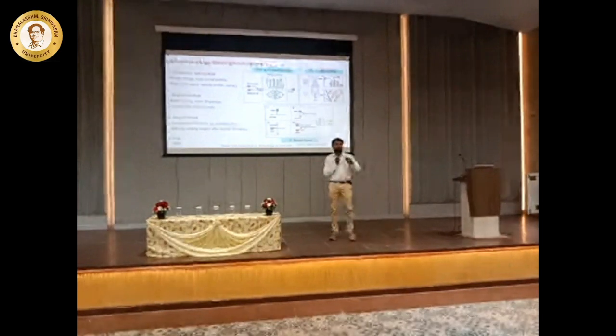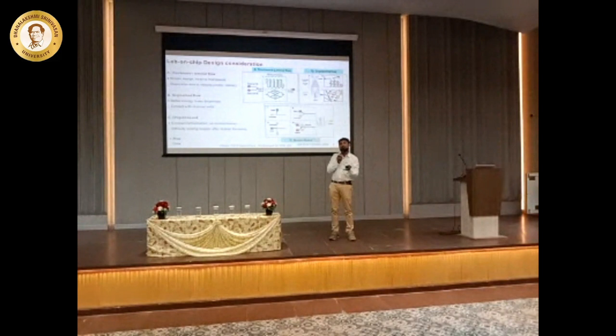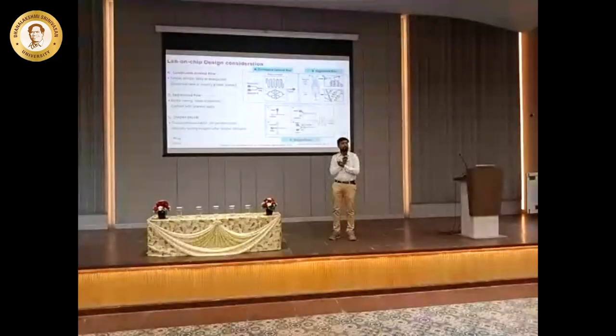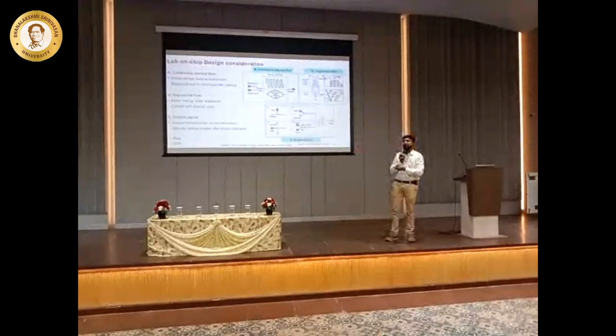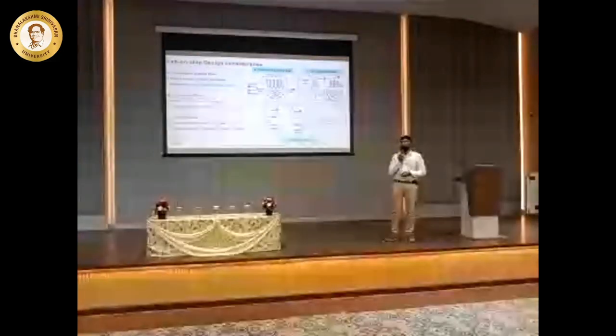So now I can tune my droplet depending on the flow rates, depending on the number of channels. I'm increasing from two inlets to four inlets. So I can do it. I can make a better reaction in the droplet, and I can create beautiful nanostructures. Right.